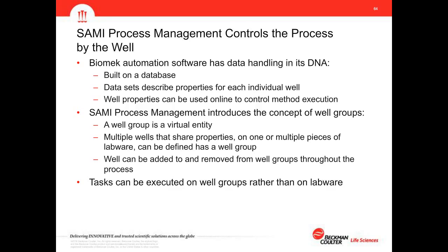It is a virtual entity, multiple wells that do share a property or multiple properties that are on a single piece of labware or on multiple different pieces of labware can be defined as a well group. And then wells can be added and removed from this well group throughout the process. The tasks are then actually executed on this well group and no longer on a piece of labware.